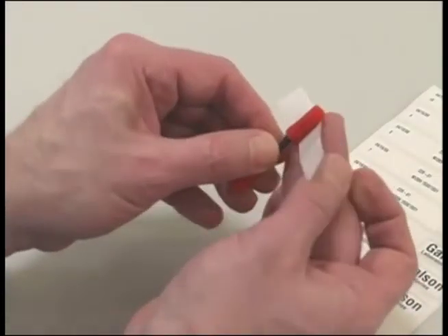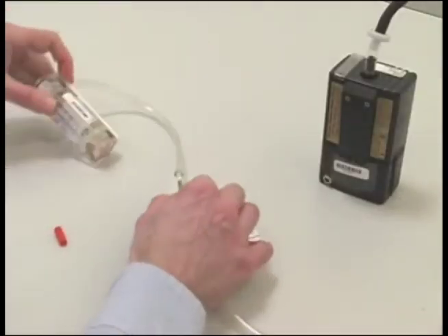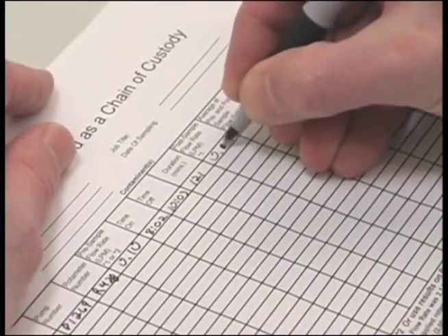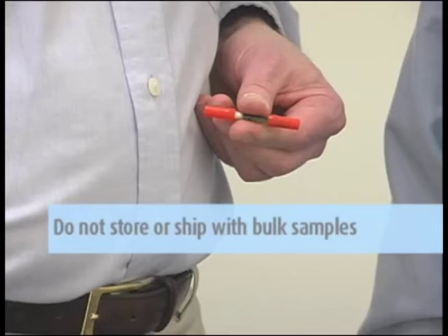Label the sample media. Perform a post-calibration in an area with the same approximate temperature as was used during the pre-calibration, then record the flow rate on the pump calibration sheet. Follow the sample storage and shipping instructions exactly. If you will be storing the sorbent tubes as the method allows, be sure to use an uncontaminated area. Sorbent tubes should not be stored or shipped with bulk samples that might contaminate the media.